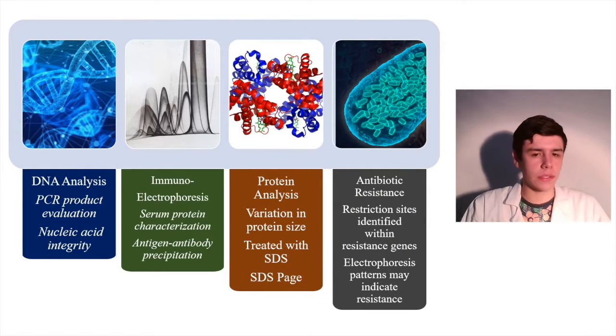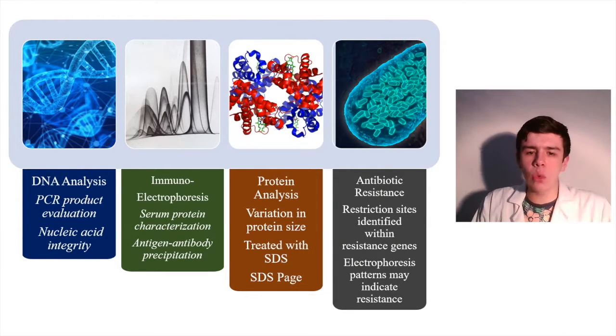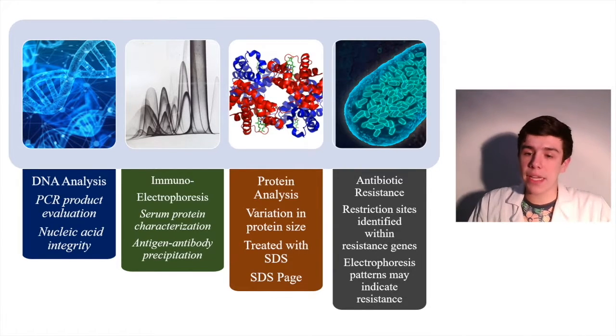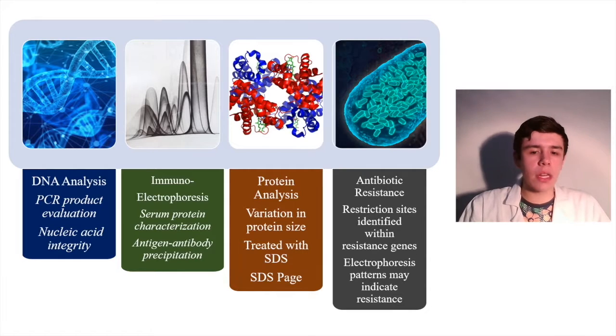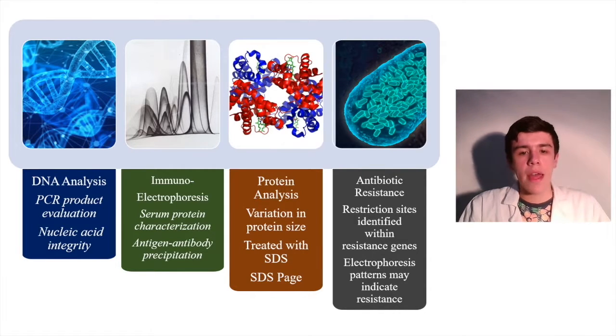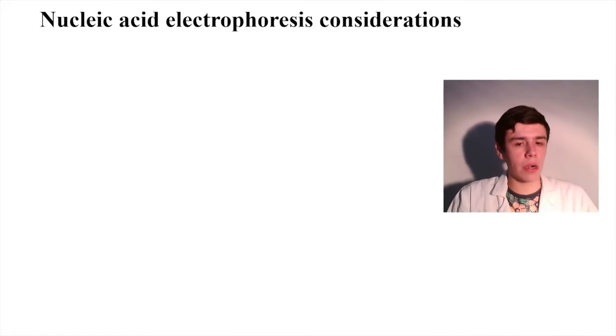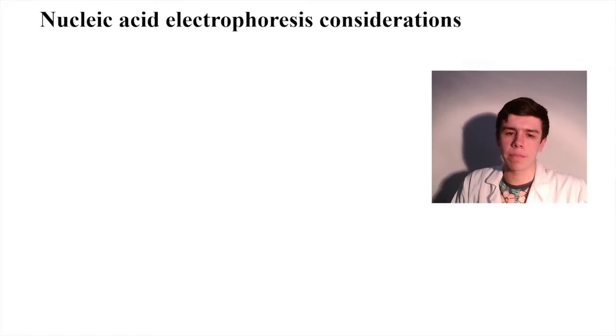Test antibiotic resistance. So as to assess induced or acquired antibiotic resistance of a bacterial strain, after DNA extraction, its genetic material can be treated with restriction enzymes that cut restriction sites found within the resistance genes. According to the patterns of DNA separation, resistance can be determined.